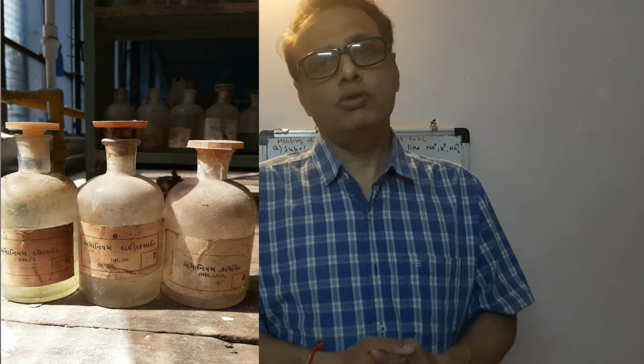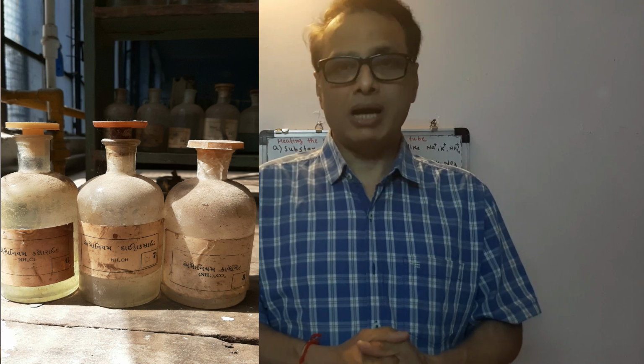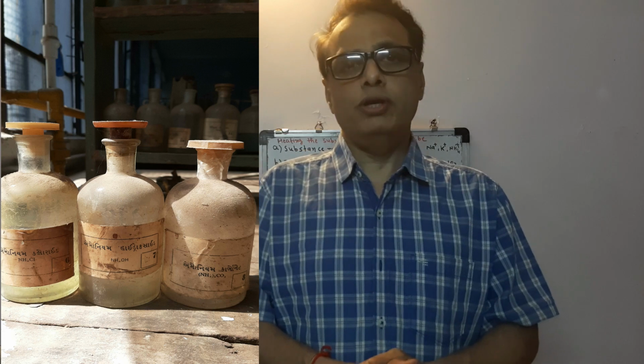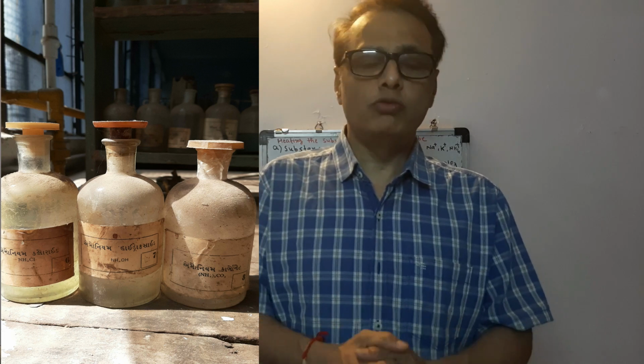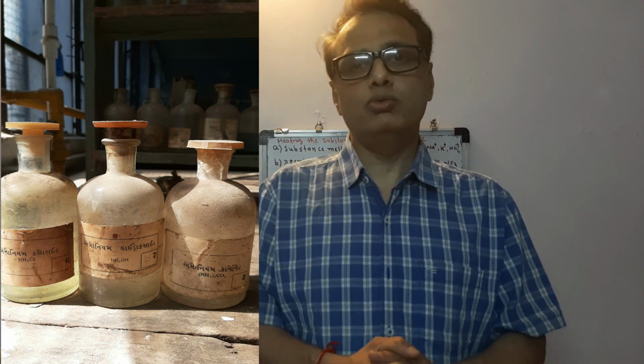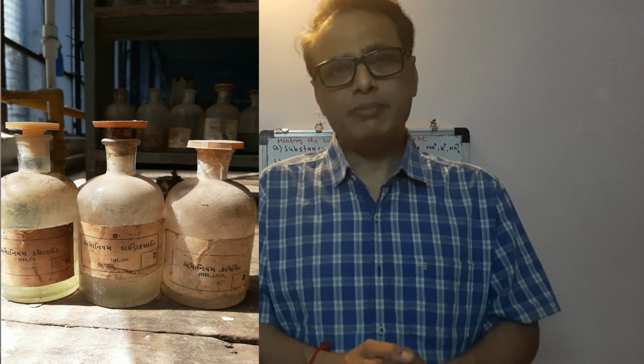Suppose if we don't get precipitates in third B group, then we have to go for fourth group. NH4Cl, NH4OH and (NH4)2CO3, ammonium carbonate, are the group reagent for the fourth group. So to perform test for fourth group, we have to take original solution, NH4Cl, NH4OH and (NH4)2CO3 in one test tube. If we get white precipitates of carbonate, then fourth group can be present. Barium, calcium, strontium are included in fourth group.